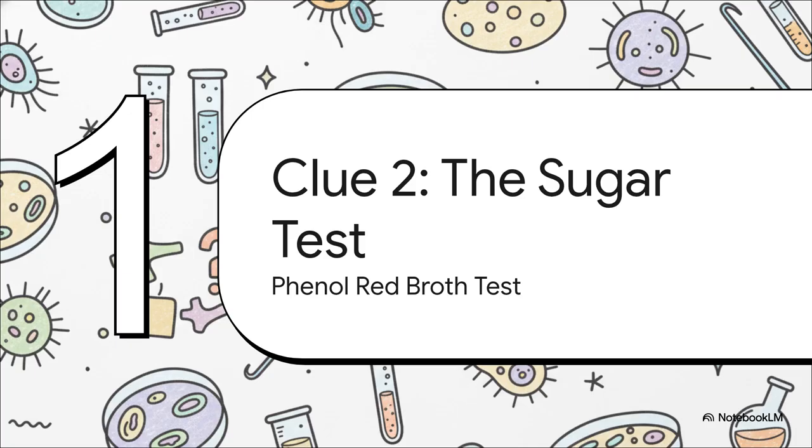All right, so now that we know how our suspect breathes, we got to dig a little deeper into its diet. Our next clue is all about finding out what specific things it eats. Can it ferment sugars like glucose or maybe lactose? And the follow-up question is, when it does that, does it produce gas? This is where the phenol red broth test comes into play.